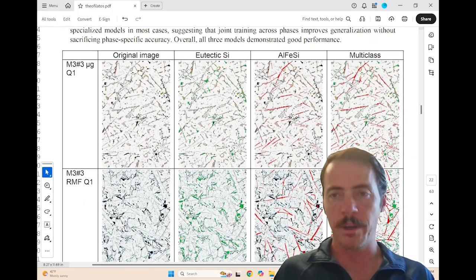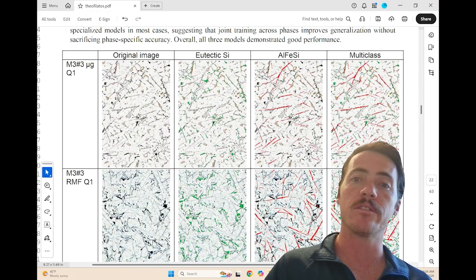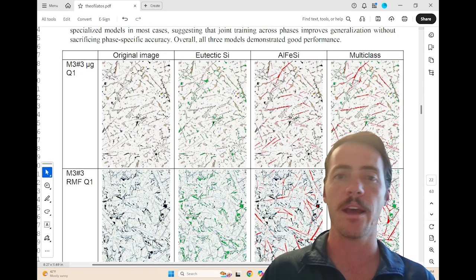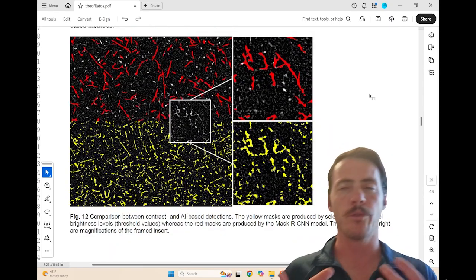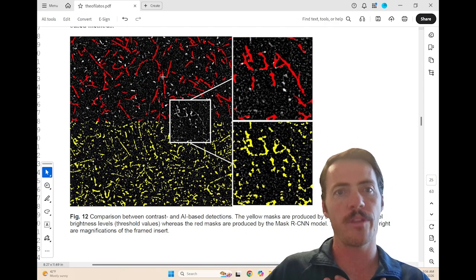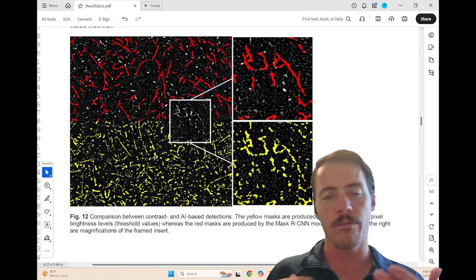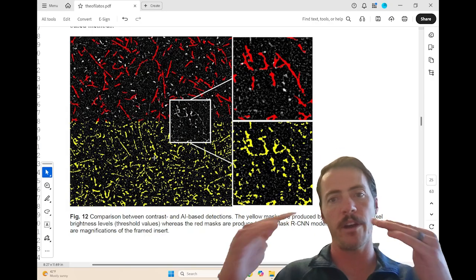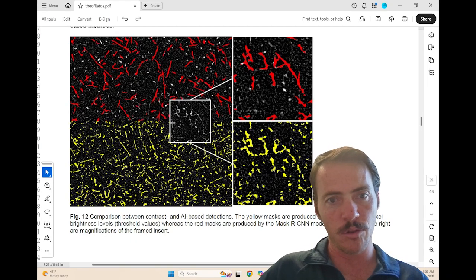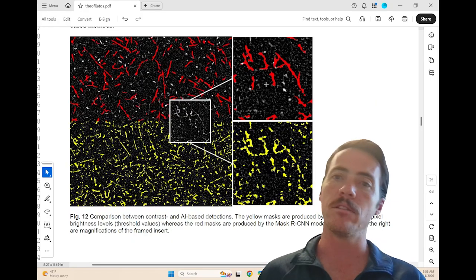And while obviously these pretty pictures look nice, you actually want to assess it against actual metrics. And they show that this actually does a better job than other segmentation techniques when you consider precision and recall of these different classes that it's being asked to segment. And again, had you done this with one of the traditional approaches, say like thresholding, you can really see the difference here. So they've done half the image in red here with the new approach. This is the Mask R-CNN model. And the other half in yellow here is just based off of thresholding, right? Where you basically say any pixel over a certain value gets bucketed in one class versus another. And you can see how, in the zoomed in white box here, it's doing a much better job with this Mask R-CNN. So this is actually an effective tool for segmentation.